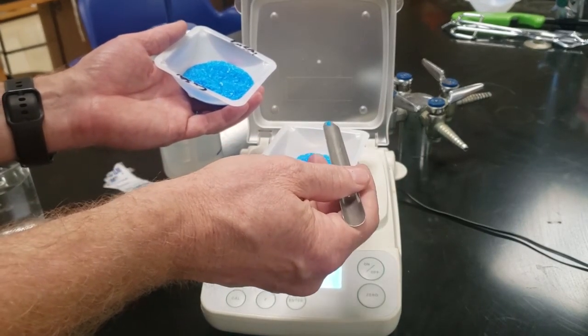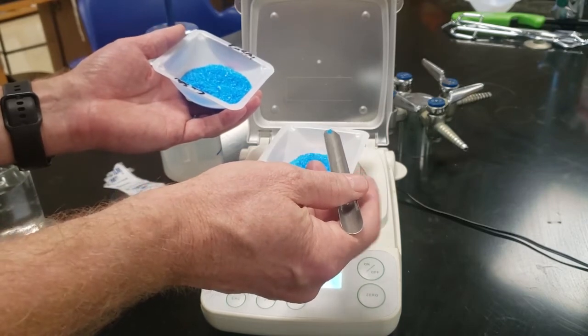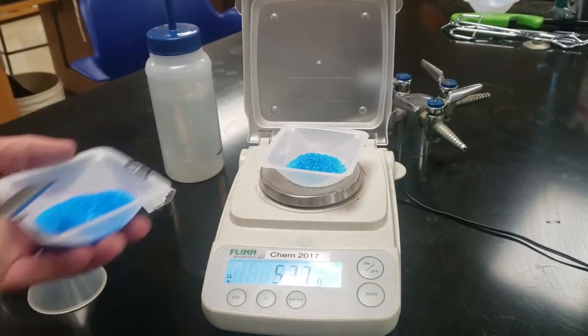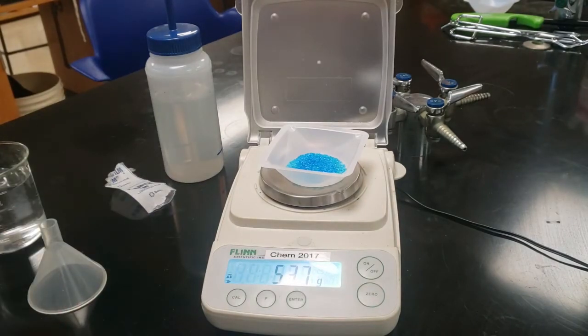You want it to be as close as possible to what we calculate. If it's more, then the concentration is going to be more. If it's less, it's going to be less. So we're going to use a method at the end to try to determine exactly what we have. Here, I've got 5.37 grams sitting on the scale.